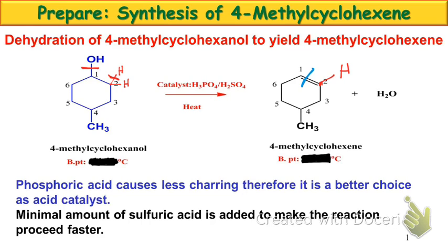So let's go back and look at the physical phases of our starting material and our product and try and determine if distillation is even a valid technique. So we could go through and evaluate our starting material. What intermolecular forces do we have in our starting material? What's our strongest one? Hydrogen bonding, because we have a hydrogen bound to oxygen, nitrogen, or fluorine. Would we expect that hydrogen force to be the primary interaction for this compound? No. Why not?